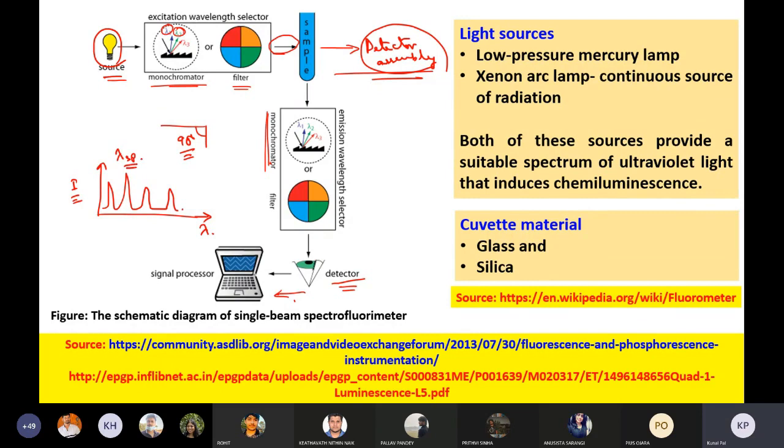Okay, so if you want to have the sample analyzed at three wavelengths, say lambda 1, lambda 2, lambda 3, you will be getting three such graphs. Okay, and another important thing, this fluorescence spectrography can help us in understanding the concentration of the compounds. Okay.